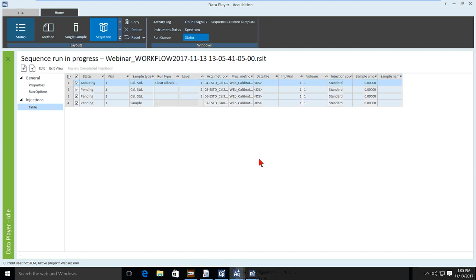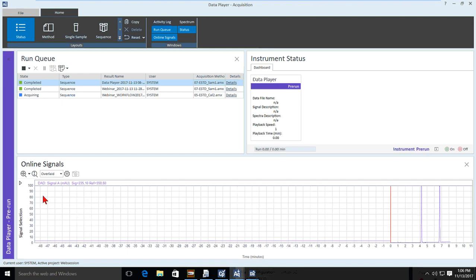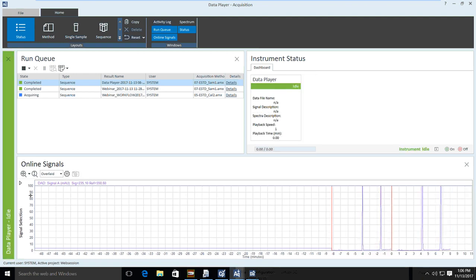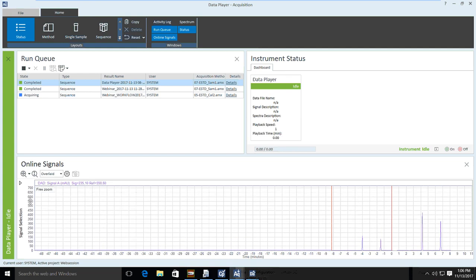All right. So as we're looking through this, you can see that it's automatically pulling some data through. All right. And this is how the data player works. It just takes longer runs, shortens them down, but actually simulates that they're longer runs. Right. So now I've got my 2 levels, so I can shrink that up a little bit to see there's my level 2.